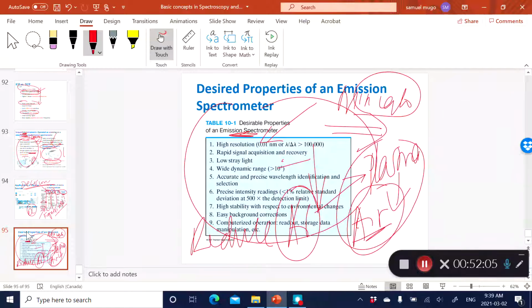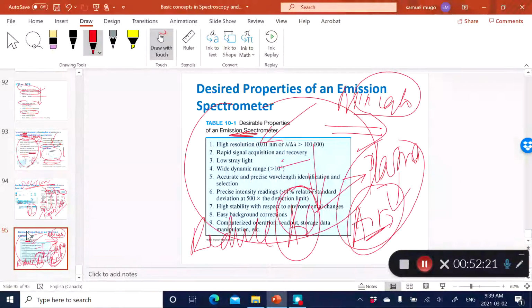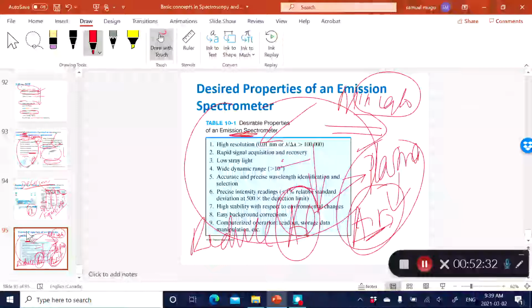The problem is air doesn't give you a very high temperature plasma, and also causes, of course, the oxidation of your samples, which is not a good thing. Whereas argon, we well know that it's an inert gas, so it causes a very inert environment when you're doing spectroscopy, which is a good thing. So that brings us to the end, really, of spectroscopy in general, especially atomic spectroscopy. In the next chapter, a small chapter really, that we're going to talk about next time is photometry.